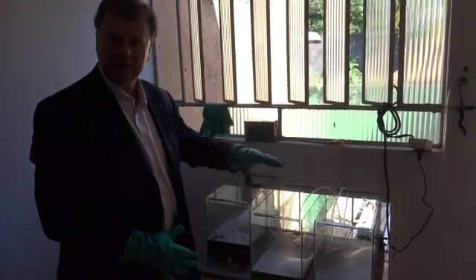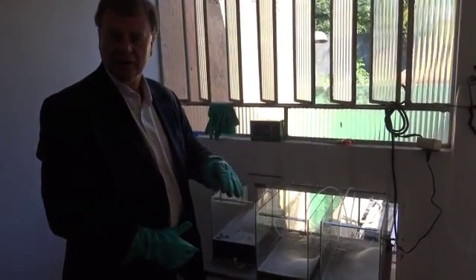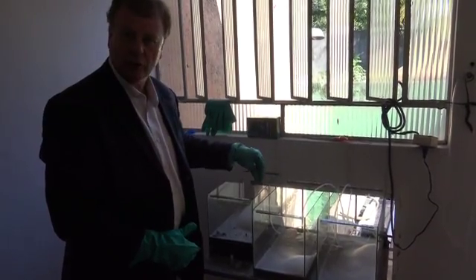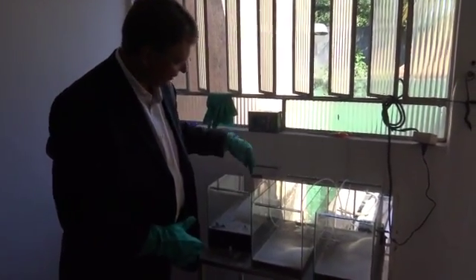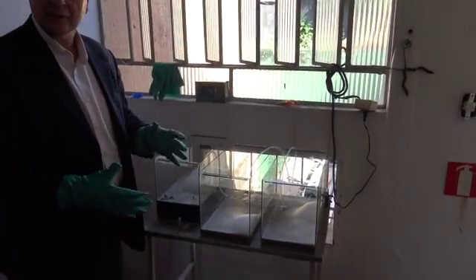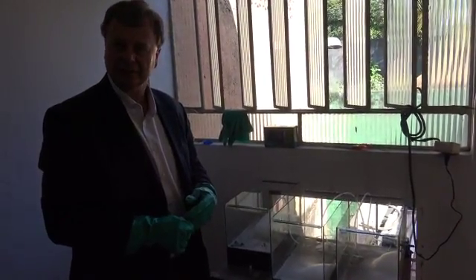Enzymes will form protein binding sites on all the carbon to induce the indigenous bacteria in Brazil waters to utilize the human waste, the oil, as a food source. This should happen quite rapidly based on how fast this reaction is right now. And what we'll do now is let it run, and in a month we'll look at the results to see where we stand. Thank you.